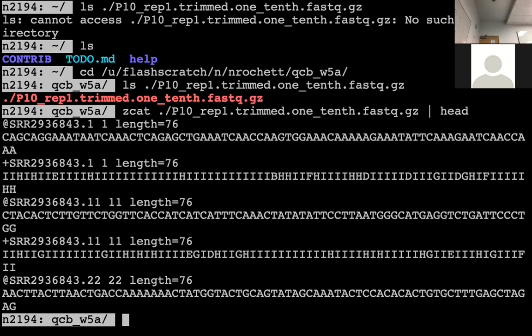Questions? If there is nothing in the output directory, it is weird. Actually, I think it created the file. You might have, yeah. So when you run.